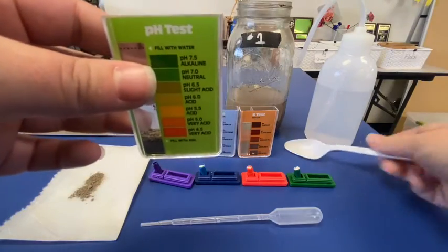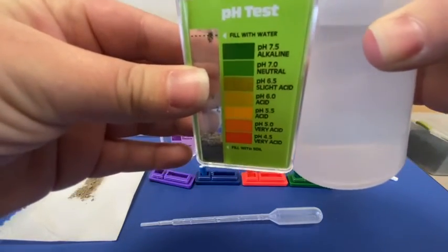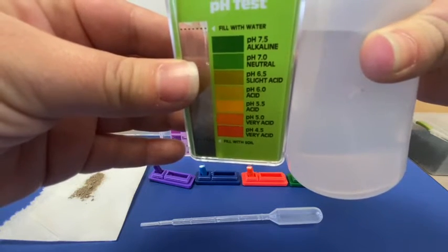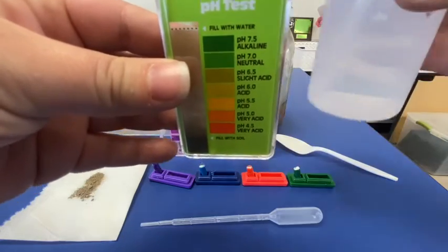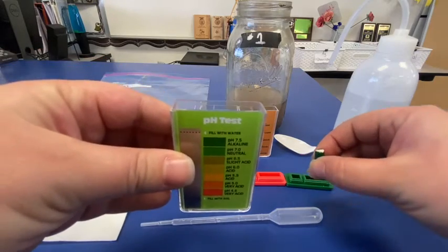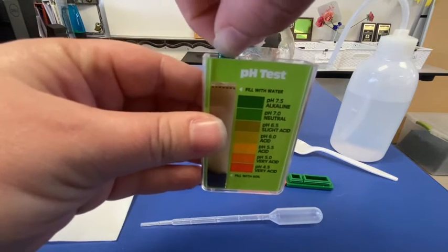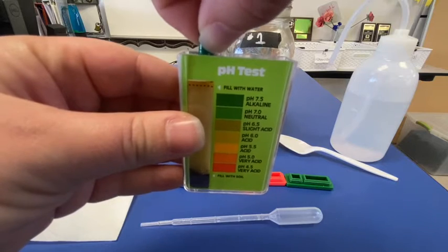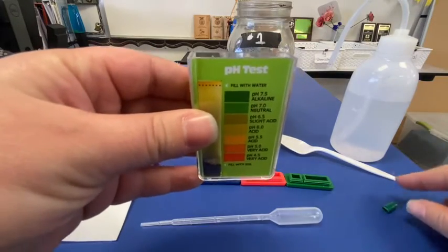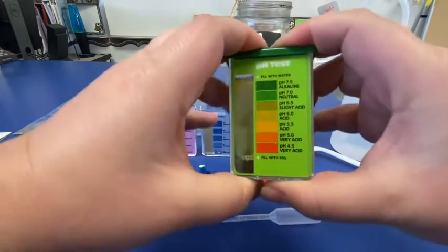Once I have that, I'm going to take my distilled water and I'm filling this pH to the second line — that second top line. I'm going to fill that up to that line. And once that's ready, I'm going to take my capsule of pH indicator. I'm going to drop just the substance inside into that test compartment. Make sure that all of that capsule is emptied out. Set that to the side and close the indicator, making sure that it seals properly — 100% closed.